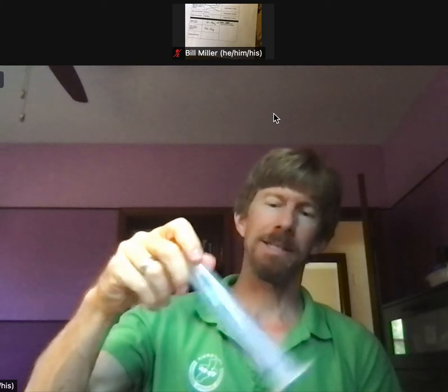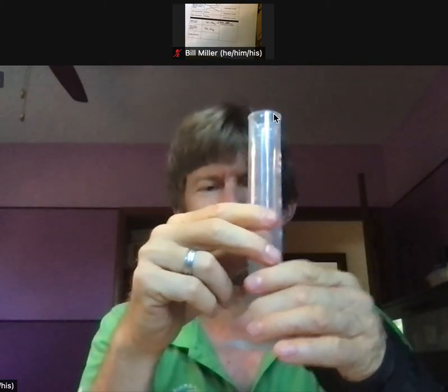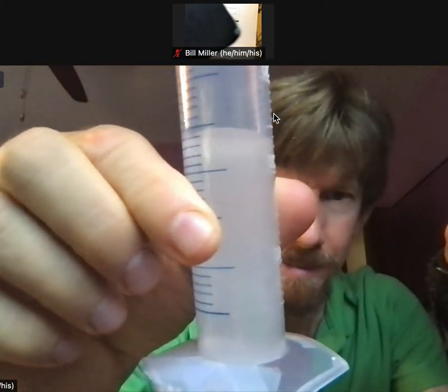While I'm swirling this, I can tell you what I'm going to do next. Since I did this in a 50 milliliter graduated cylinder, I'm going to go get my 100 milliliter graduated cylinder. I'm going to pour this into the 100 milliliter graduated cylinder, and then I'm going to rinse this three times. Ooh, looks like we got some bubbles, huh? So rinse this three times and put the solution into the 100 milliliter graduated cylinder. And then, ooh, we're getting close. I'm going to fill it up to 100 milliliters. I'm going to put my plastic wrap on it and set it aside for next week's experiment.